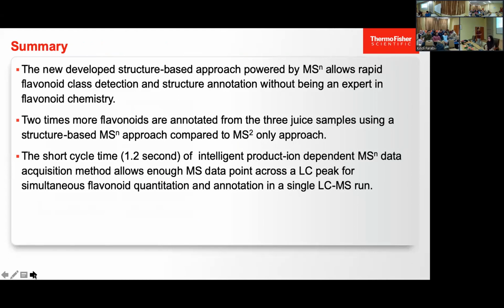So this will be my last slide. Analysis on synthetic compounds and natural products is sometimes straightforward. When it comes to discovery of a new compound, it will be tough. It is very much dependent on the structure, and also on the online database available, coupled with your NMR data. You are able to detect more compounds, and more importantly, you can do structure annotation.